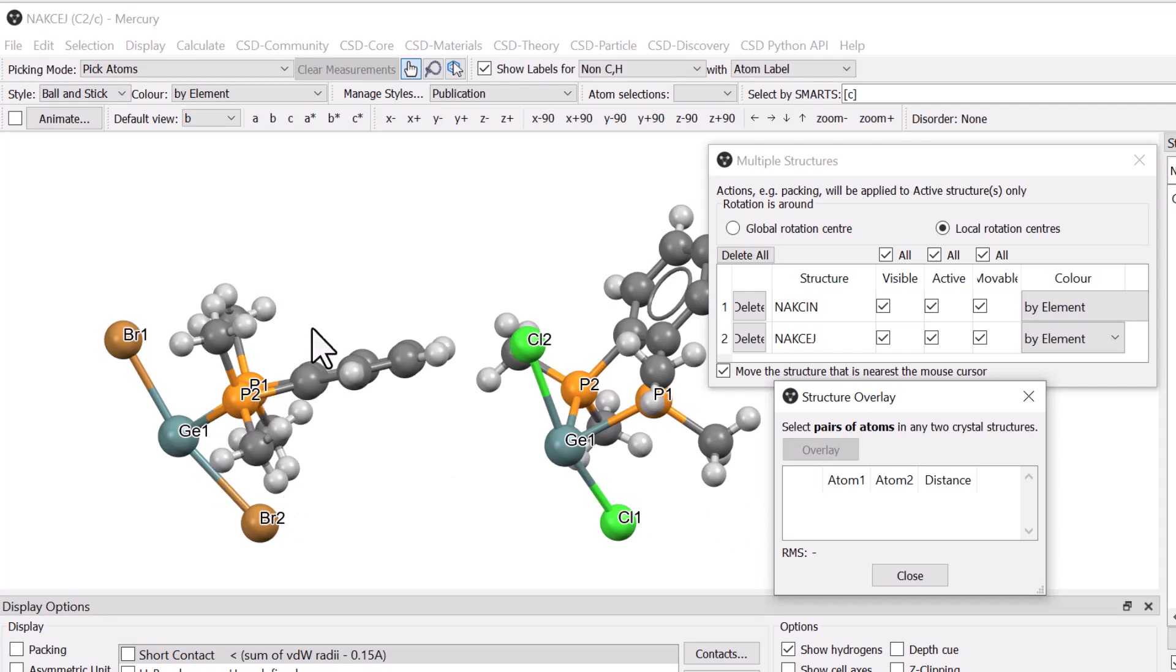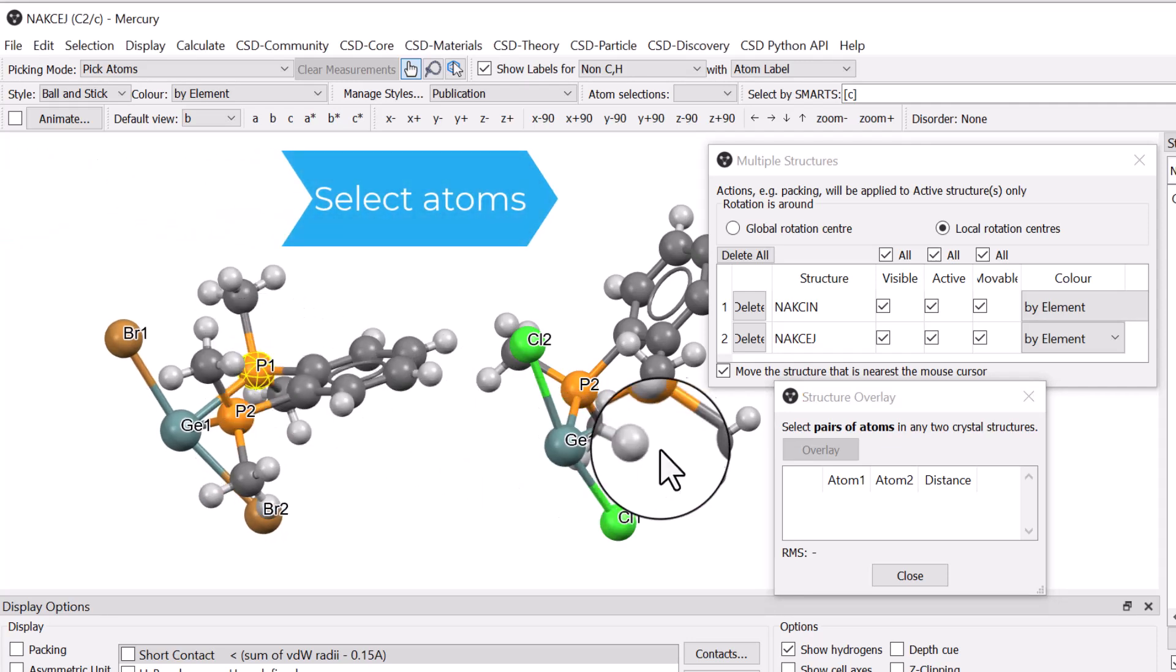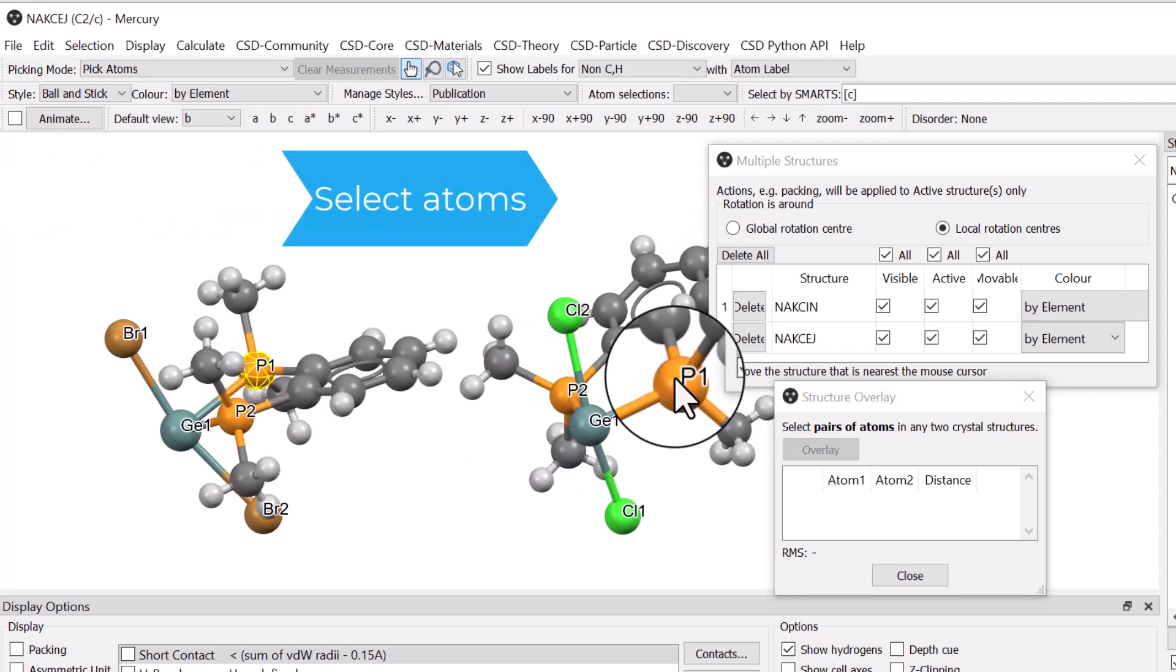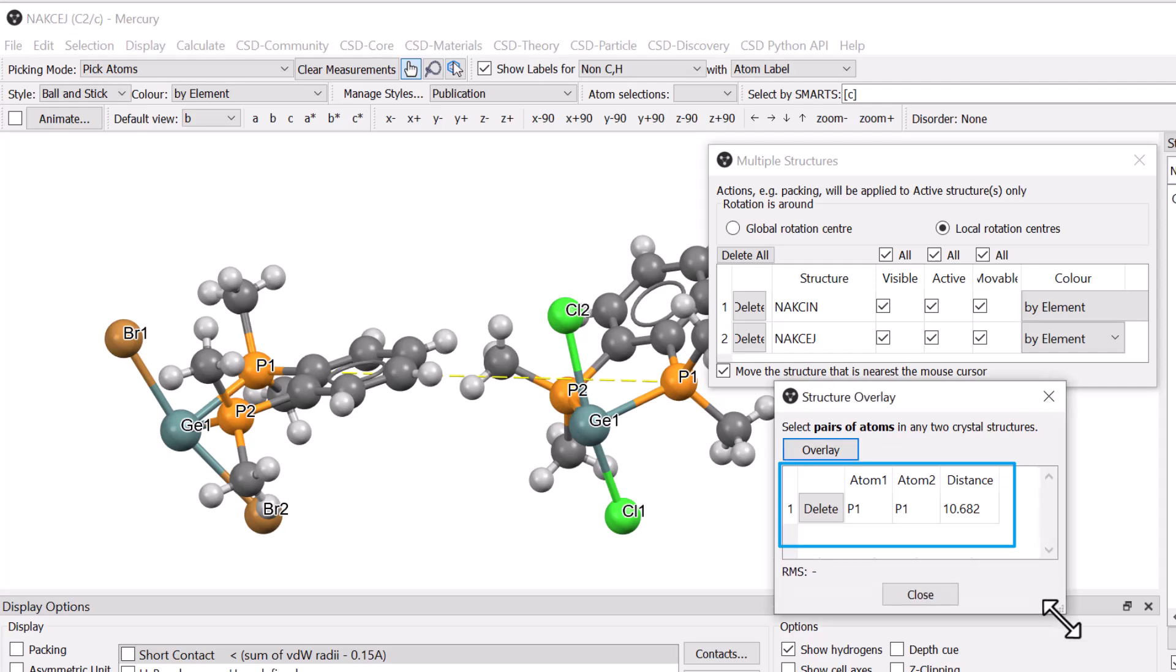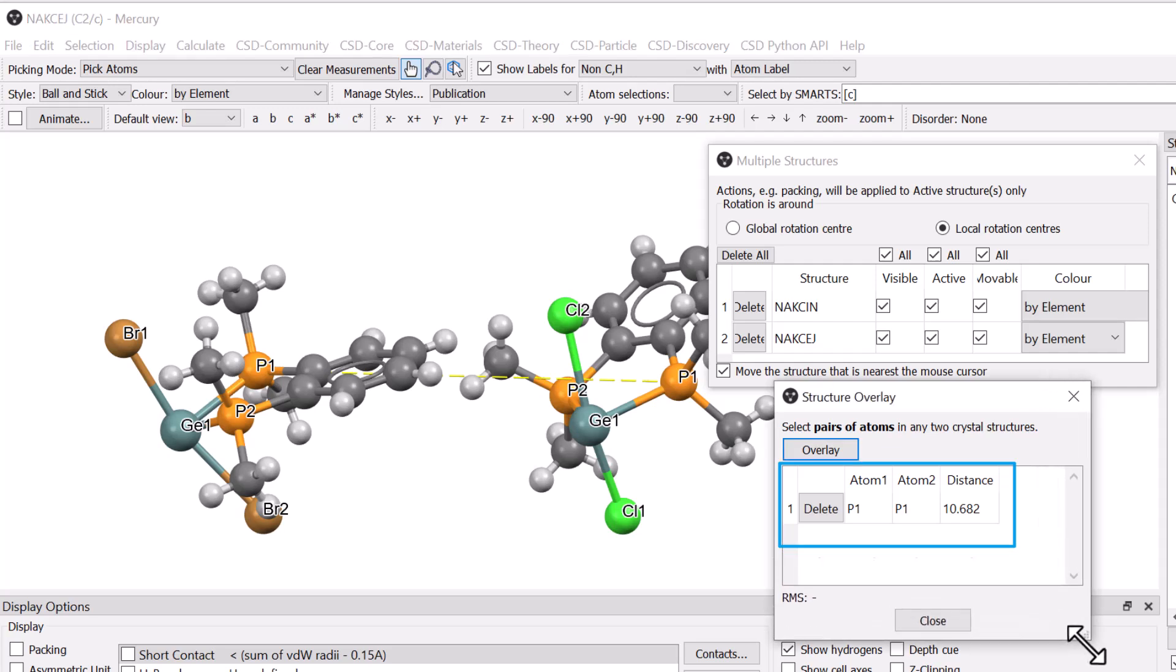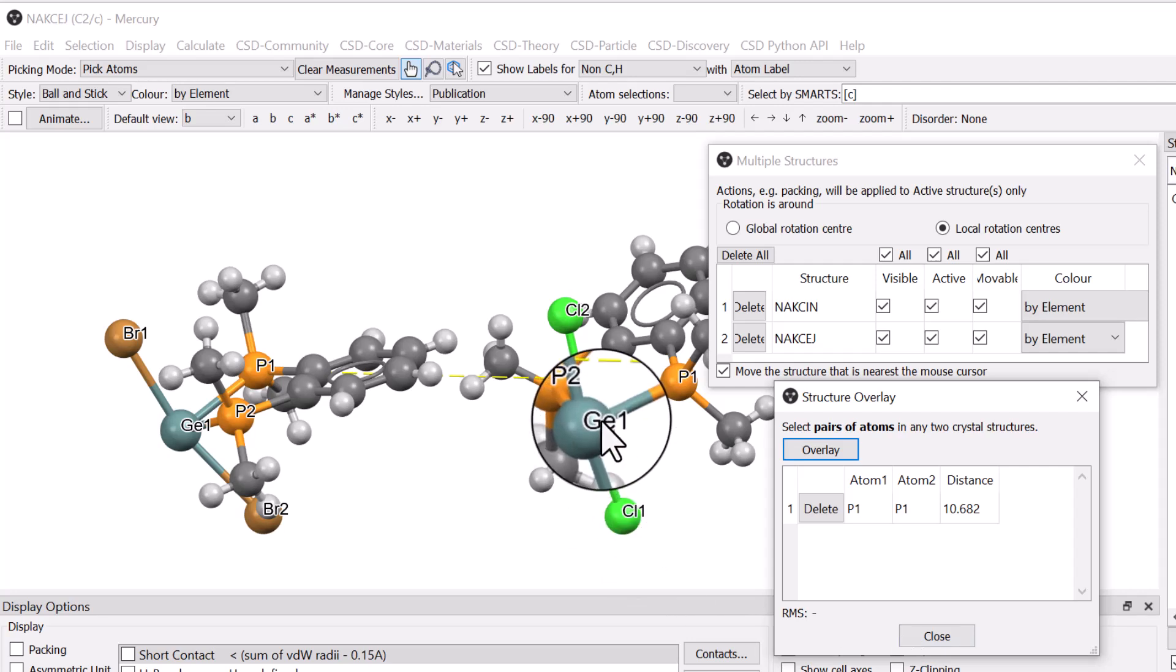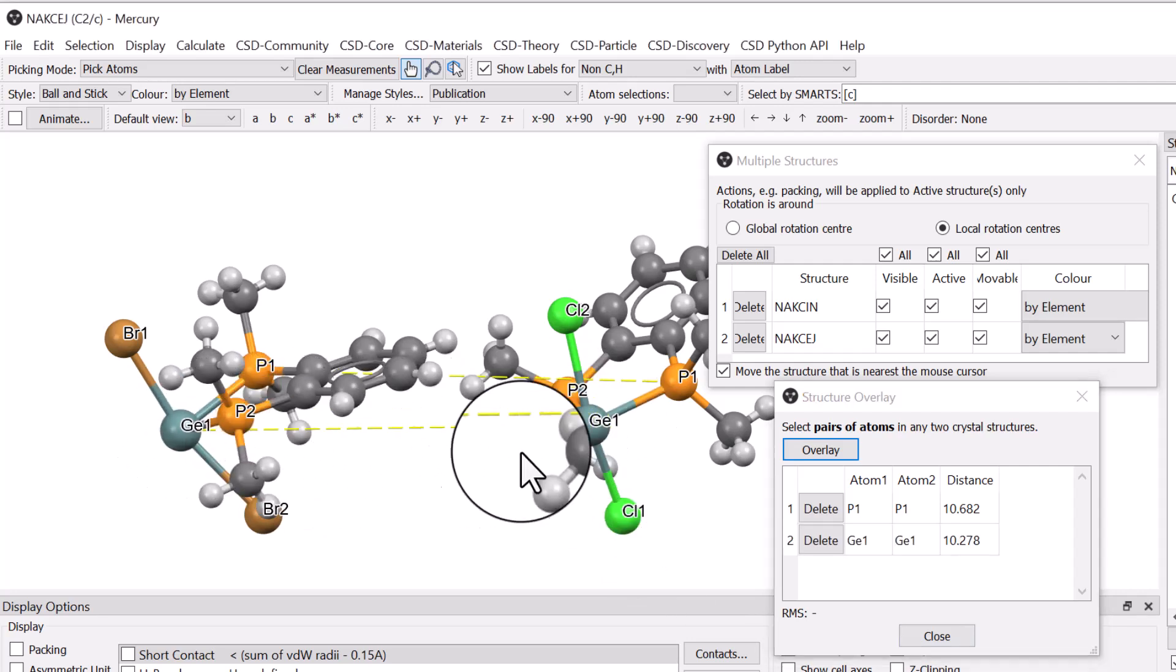Clicking on atoms P1 in NAKCIN and P1 in NAKCEJ adds them to the Structure Overlay window and reports the current separation corresponding to the length of the yellow dotted line. We can do the same for the GE1 and P2 pairs of atoms.